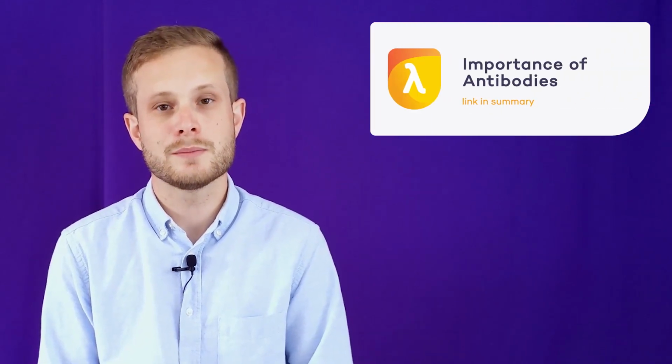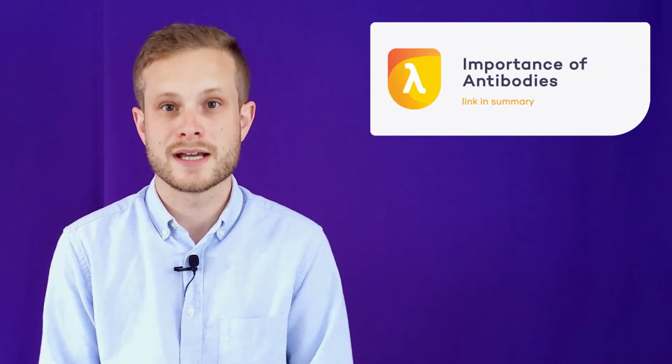We discuss the main types of primary antibodies that you can choose from and provide detailed advice on the selection process in another Lambda U learning path, The Importance of Antibodies. But as a brief summary, these fall into one of three categories.